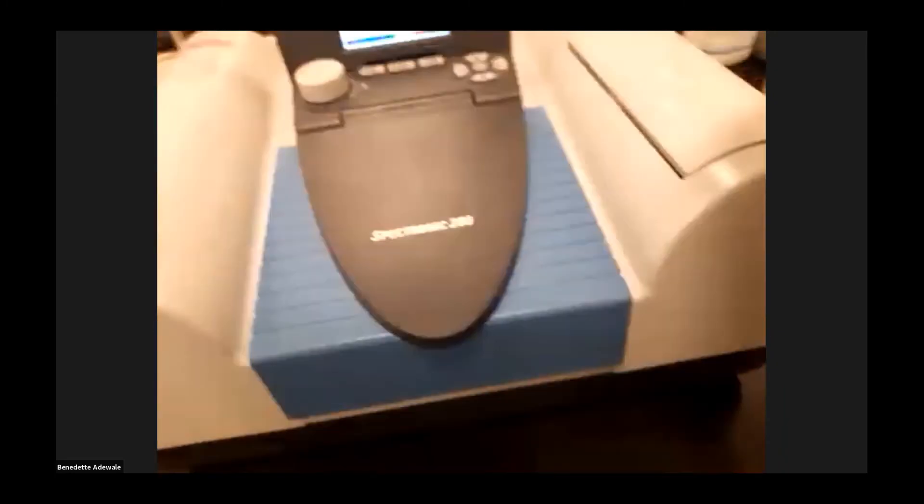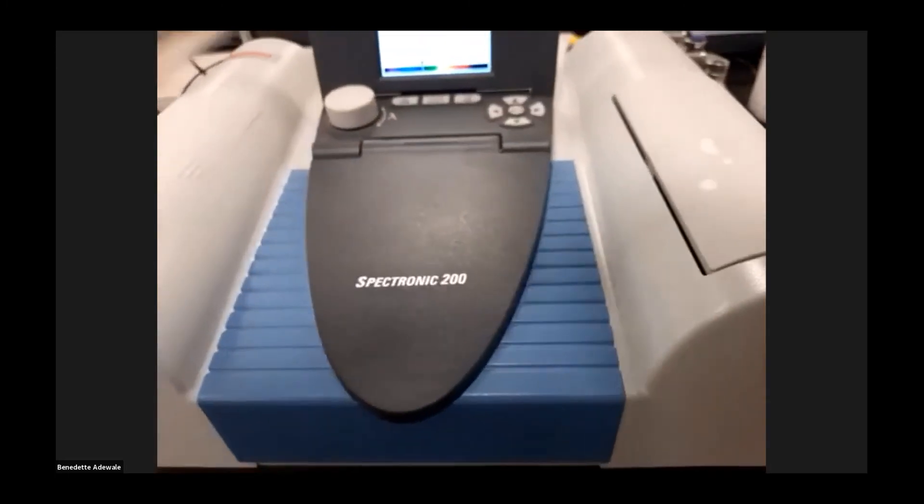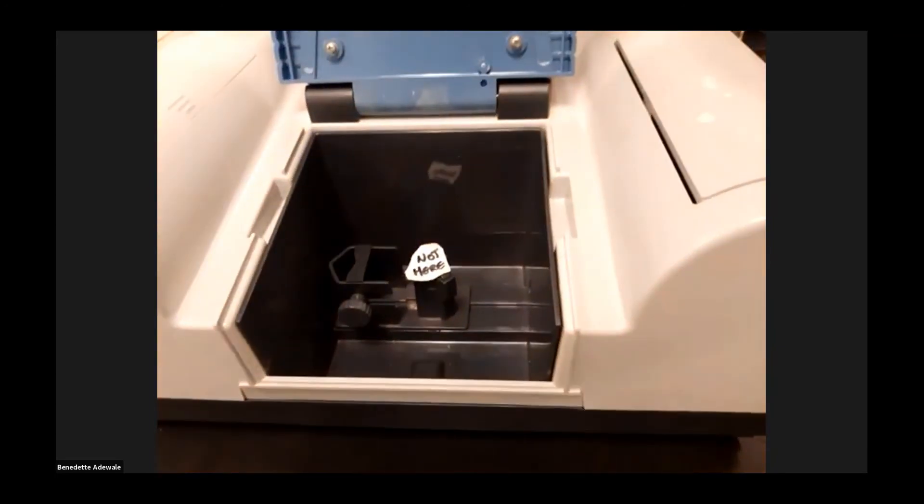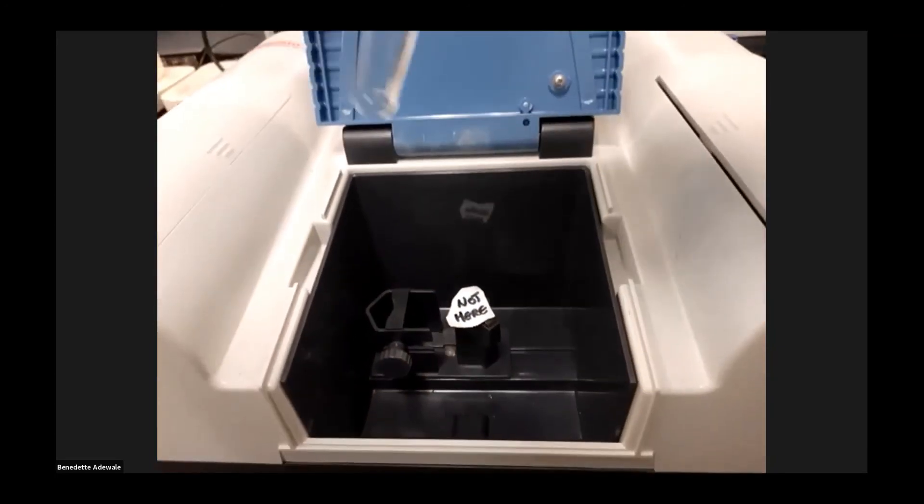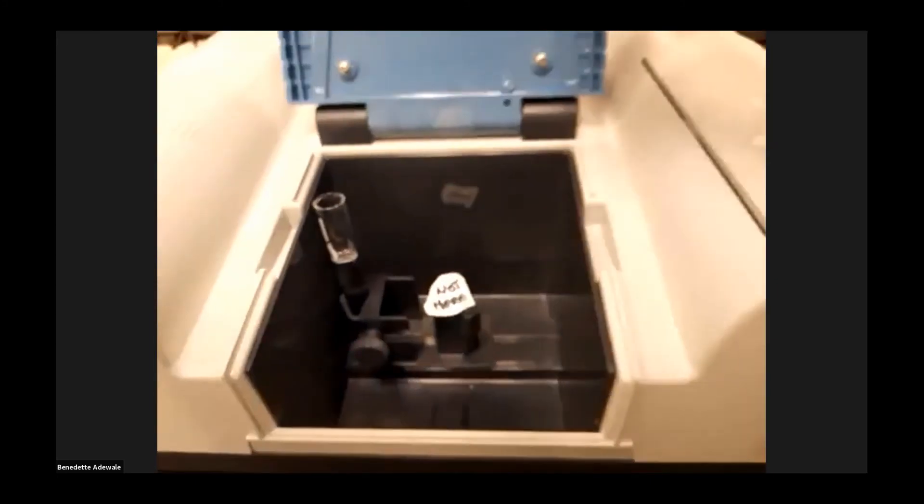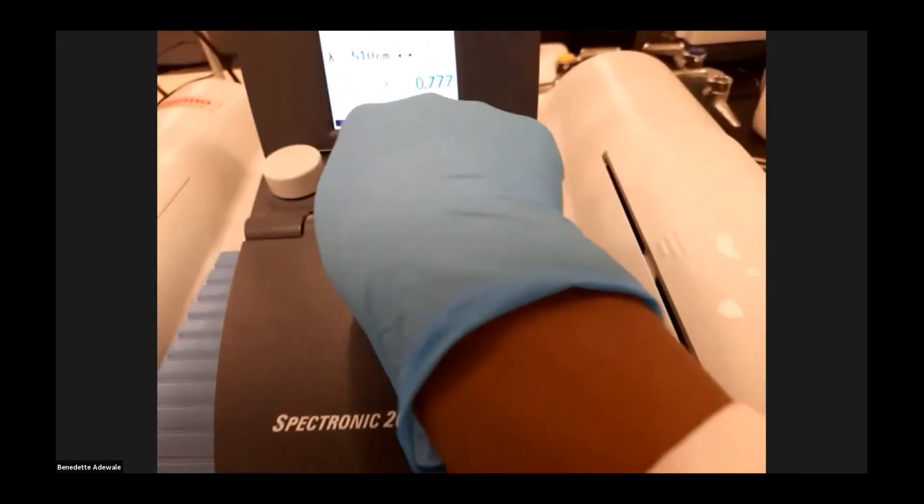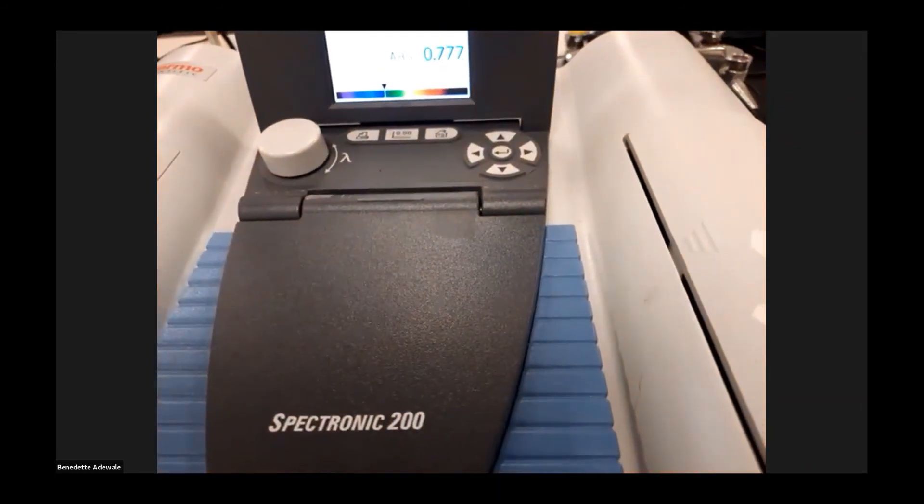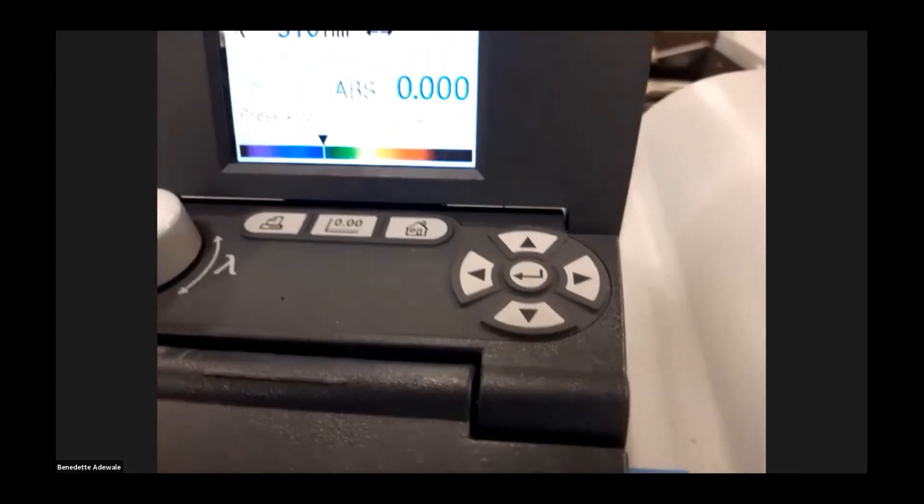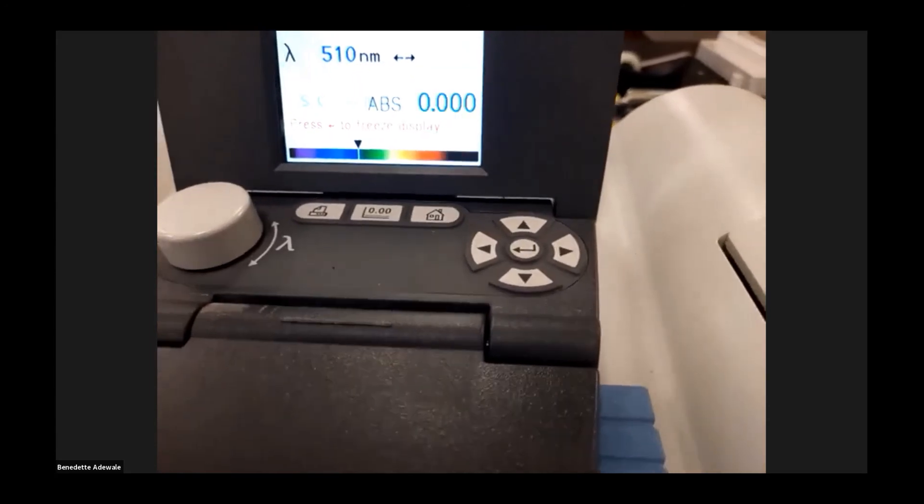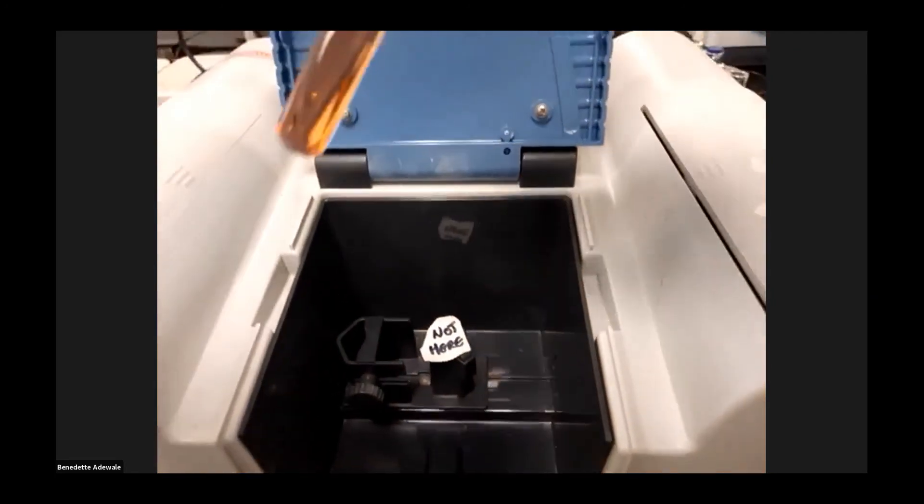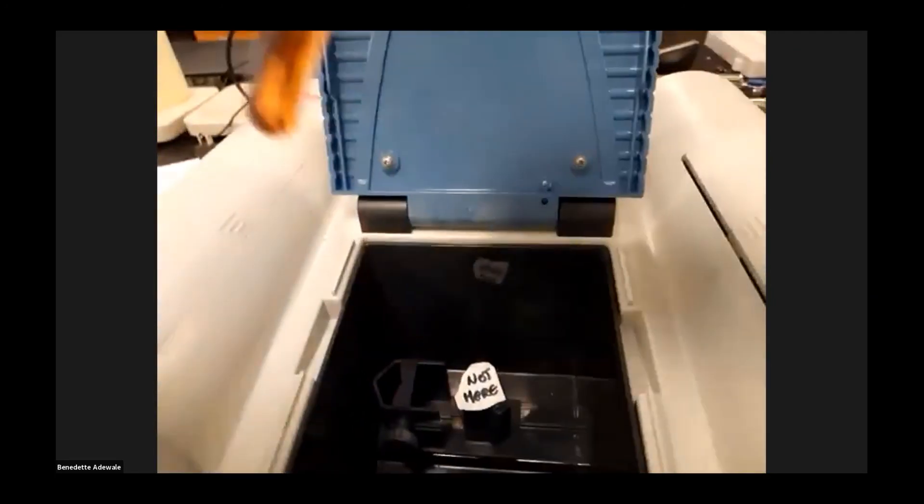A blank solution is going to be provided for you for calibration. Open the sample compartment. Make sure in the sample compartment, the samples go on the left-hand side. In order to zero it, you press the middle button zero. Make sure you remove the blank sample. Then you can now take the absorbance of each of your solutions.